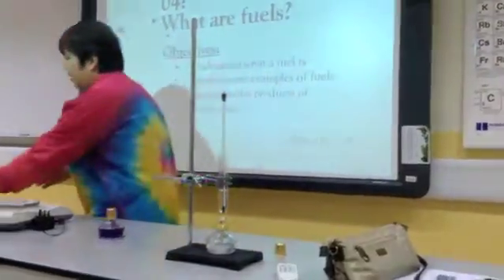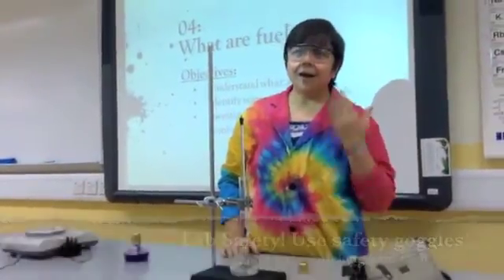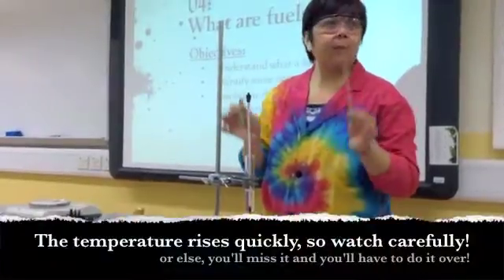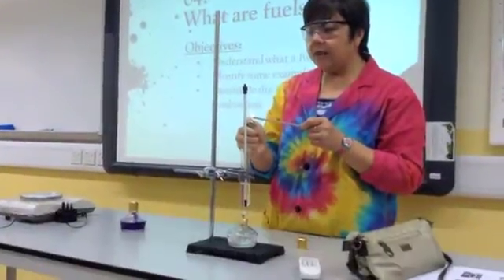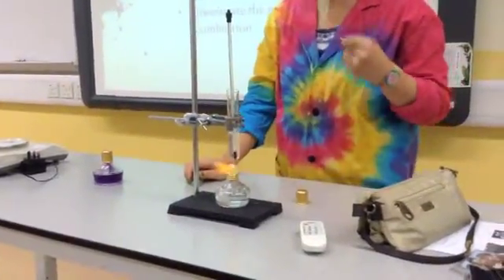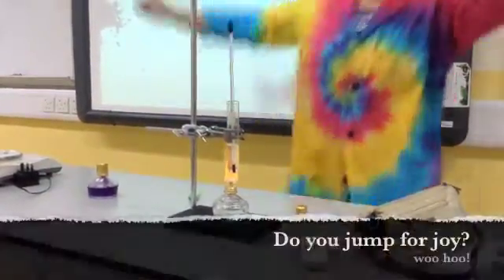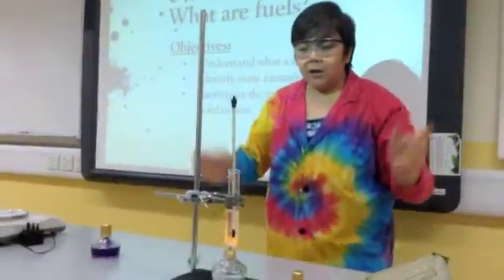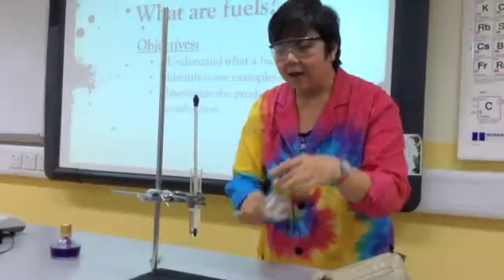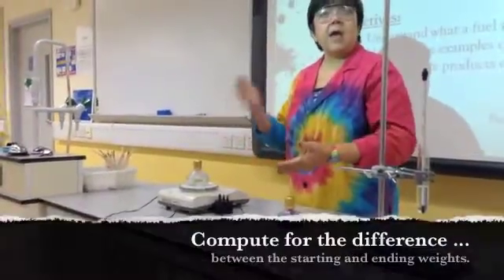How do you light this thing? You need your safety goggles and a lighter and splint. The temperature goes up quickly, so you really need to keep your eye on this. You light the splint, and you light the wick — and there you go. Once it hits 66 degrees, you need to pull it out and cap it. Then you go over to the electronic balance and weigh it again to get the difference.